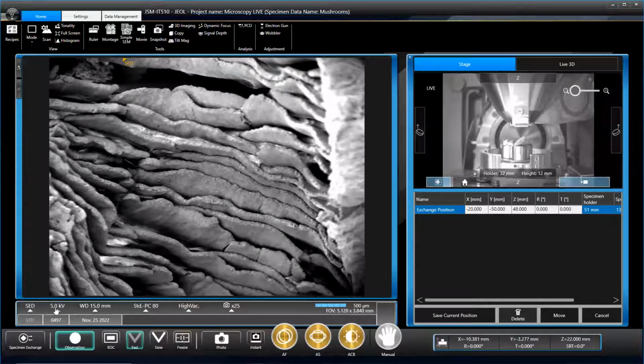We've got our accelerating voltage, which is currently at 5,000 volts. So actually not very many in the world of electron microscopy. For geology, we often work around 15 to 20,000. Some of the TEMs go up to like 110. It's horrifying. So why do you not need so many on this one? Because we're interested in the shape, and there's quite a lot of detail in that. The bigger the voltage you have, the more of an area it affects. So it's really good for looking at compositions because you want to get all those X-rays back out of the sample. But for this, we just want to see what things are where, basically.